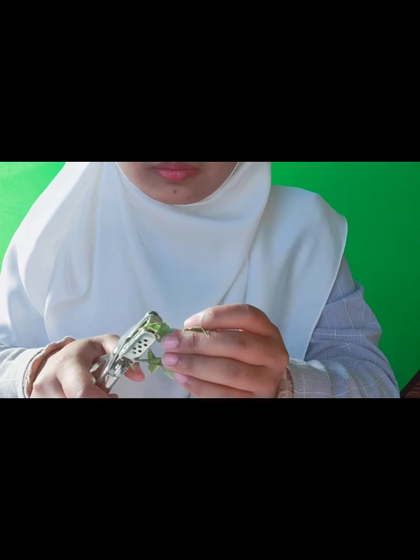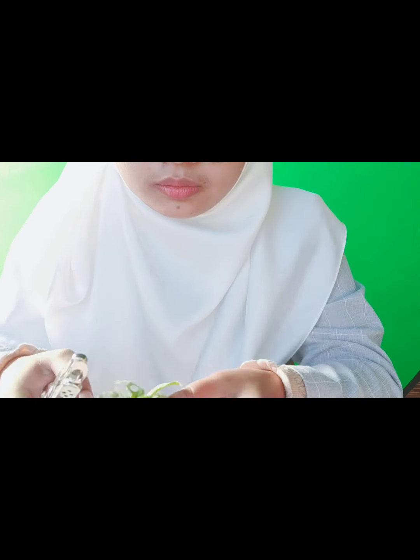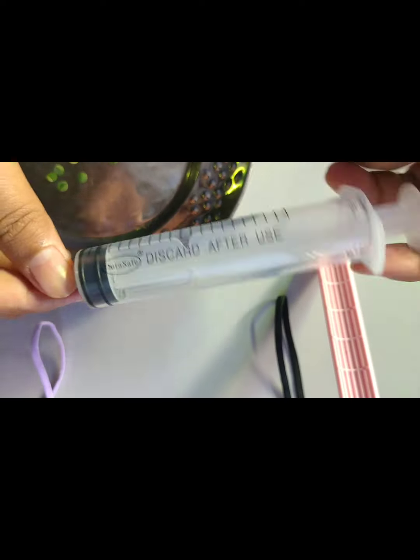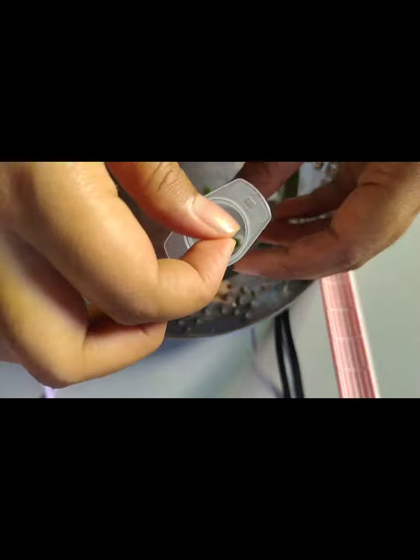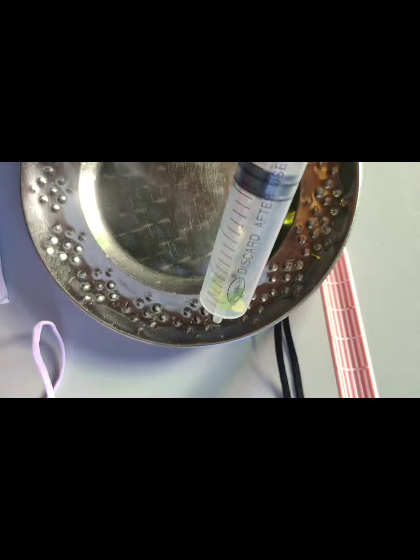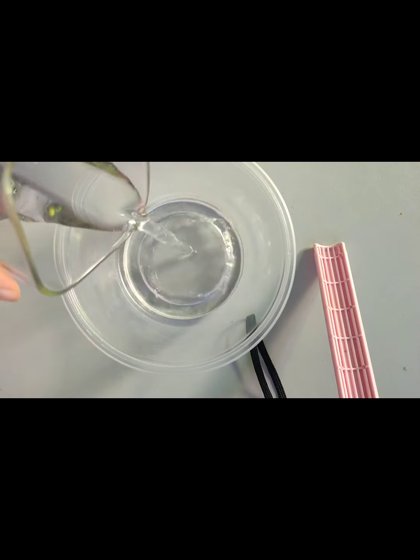After we take the plant and make holes with the hole punch, we get only 10 leaf discs from the plant. We take the syringe, pull out the plunger from the syringe and place the 10 leaf discs in the syringe. And then we replace the plunger back into the syringe, carefully so as not to damage the leaf.